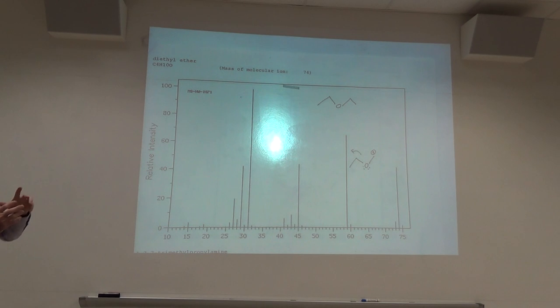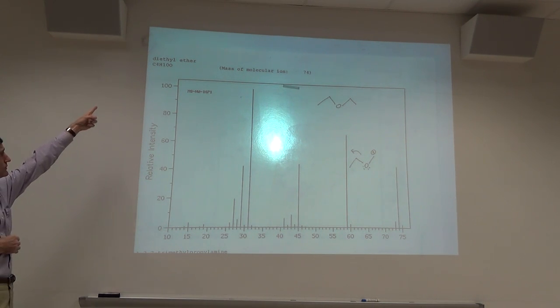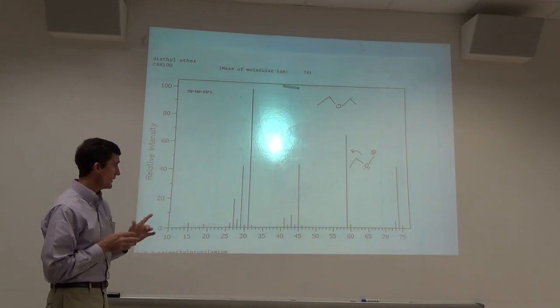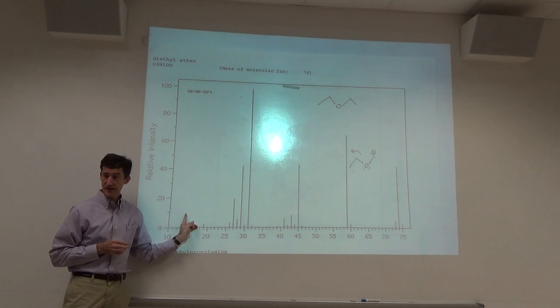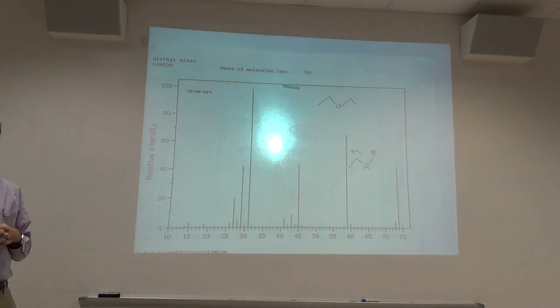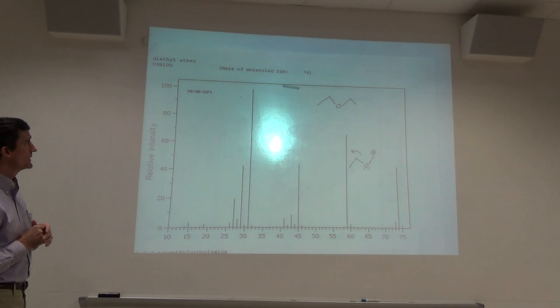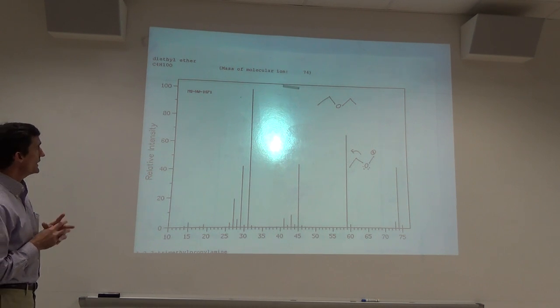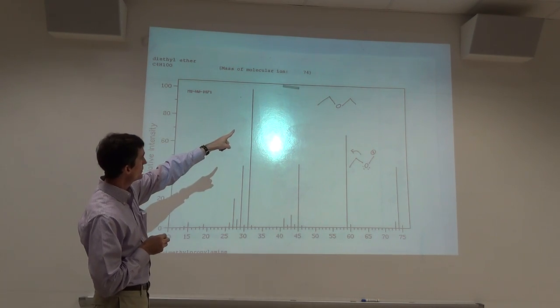This ether has a molecular weight of 74. That's molecular weight, right? C4H10O, 74. That's a whole number. By the way, we're typically doing whole numbers in the mass spec that we're doing. You can do what's called high-res mass spec. The textbook talks about that. That's where you get like 3 or 4 decimal places. Here, typically whole numbers, or low-res mass spec. Okay, molecular weight of 74.